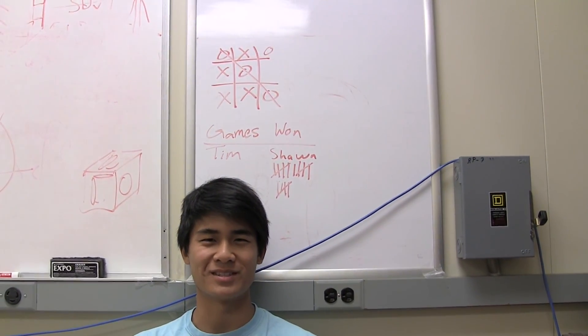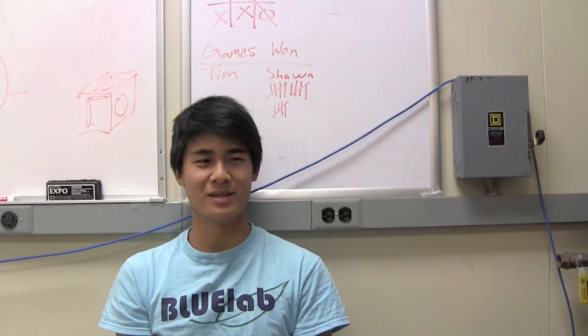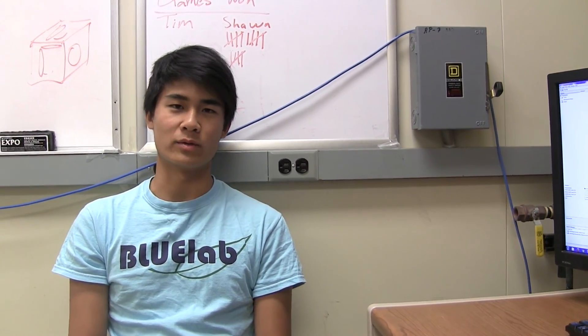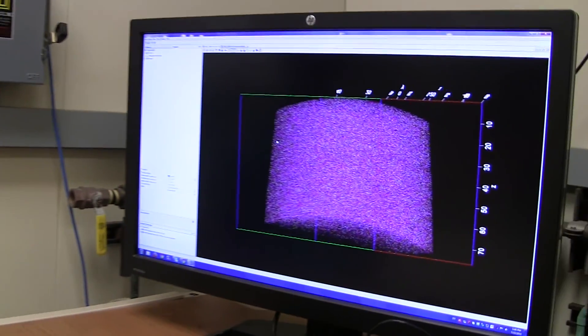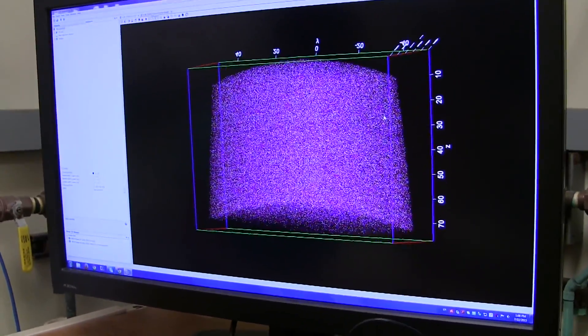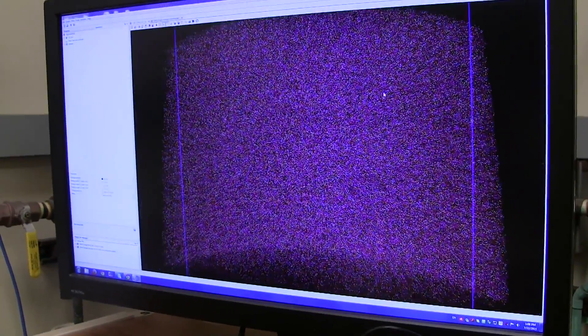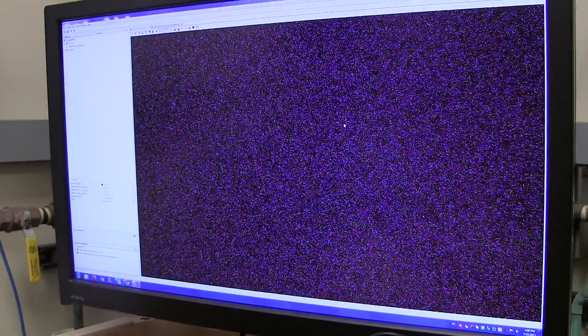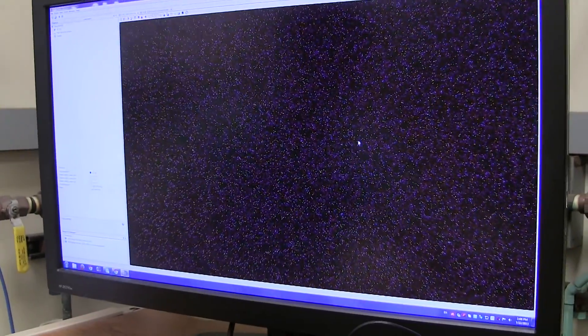Once we've gathered our data from the atom probe, we can use that data, specifically the time of flight information, the mass to charge ratio information, and go back to the computer and do essentially a reconstruction using that data to put together what we have created through the metal tip. So here, you can see a reconstruction that we've done. And essentially, this is what a computer model of our metal tip looks like. And as you can see, every single one of these little dots represents an individual atom.